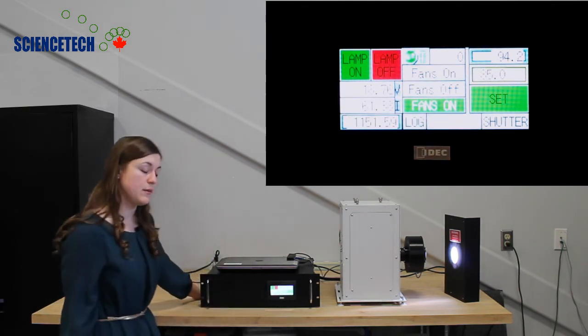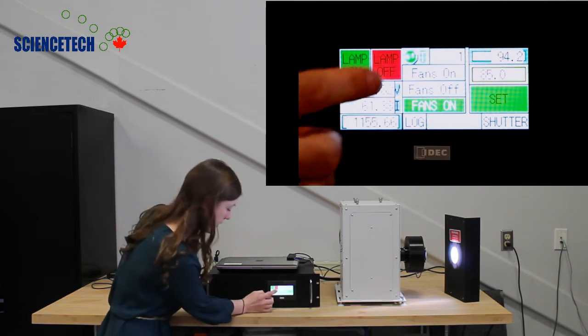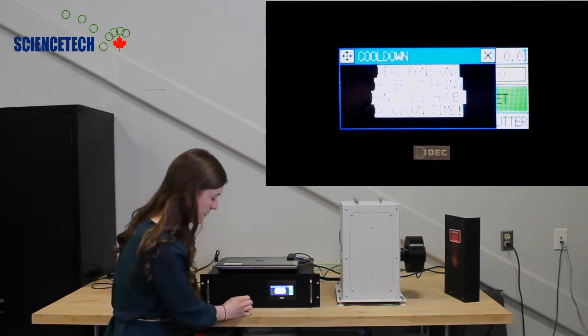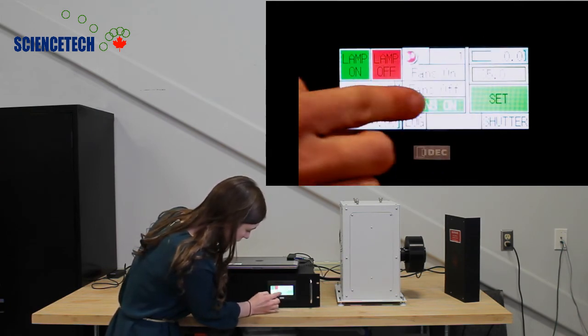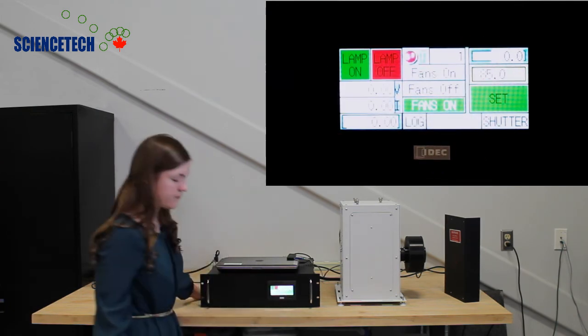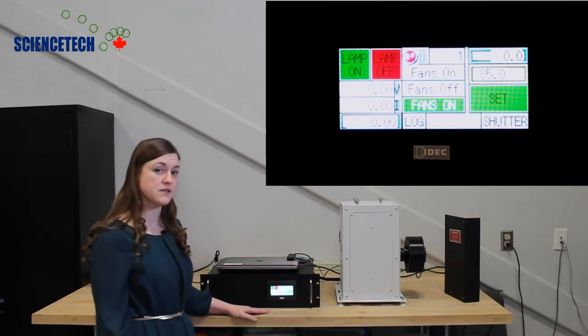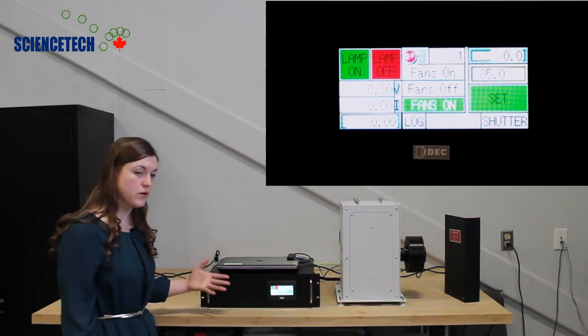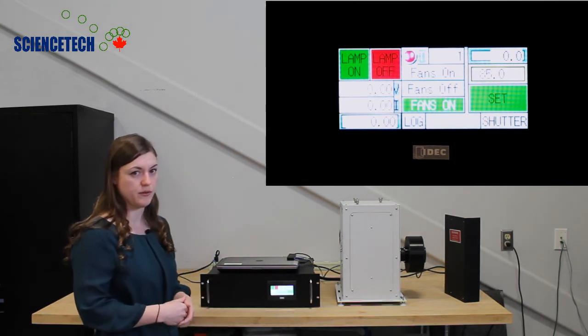To turn the lamp off, first start by hitting the lamp off button. It'll prompt you about the fans. So just hit fans off from there and it will turn the fans off. Notice that the monitor still says fans on. That's because it's going through its programmed cool-down period, and the fans will turn off when that period has elapsed.